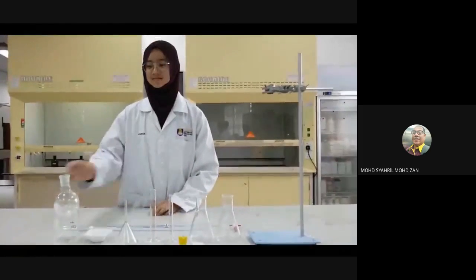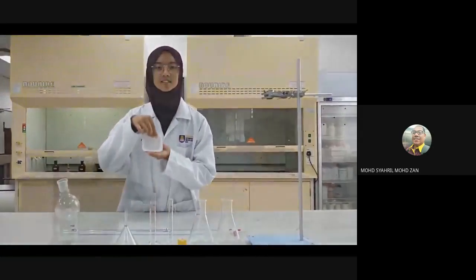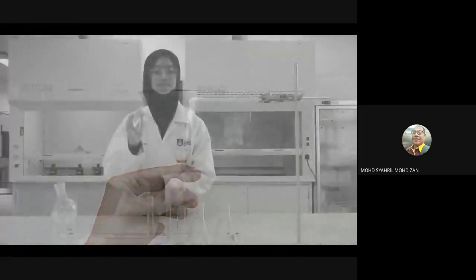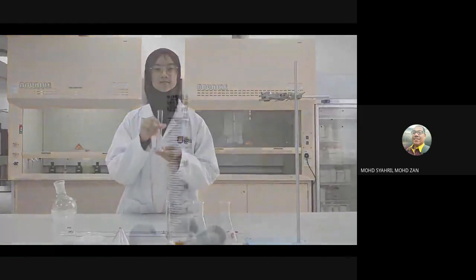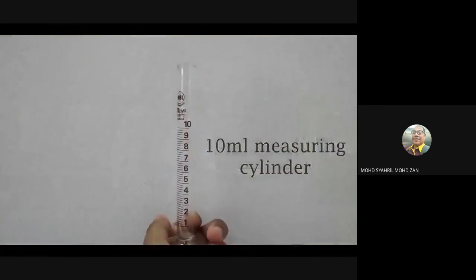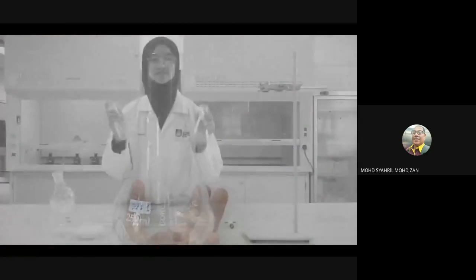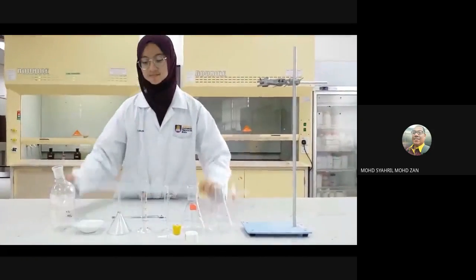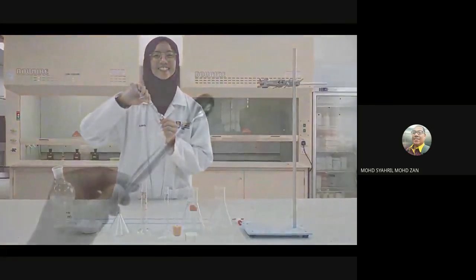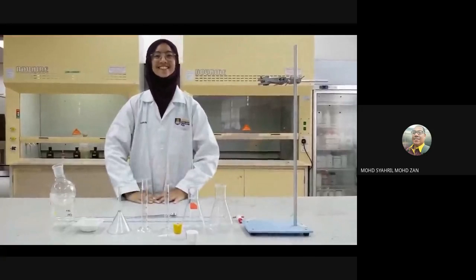In the experiment, the apparatus that we need are round bottom flask, weighing bowl, filter funnel, 25 ml measuring cylinder, 10 ml measuring cylinder, conical flask, burette, spatula, and lastly, retort stand.